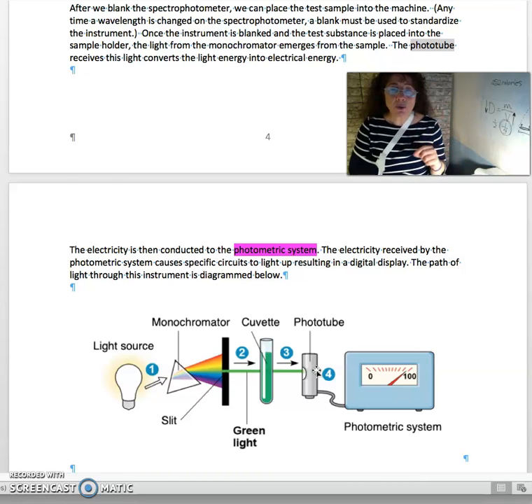And number two, with those results, we're making sure that when we add in our green solution, we can subtract out the knowledge we have of absorption and transmittance of the water and just record the absorption and transmittance of the green solution. So using a blank accomplishes two things.